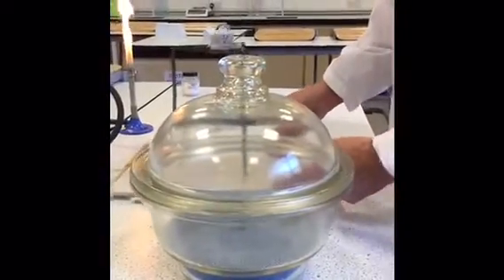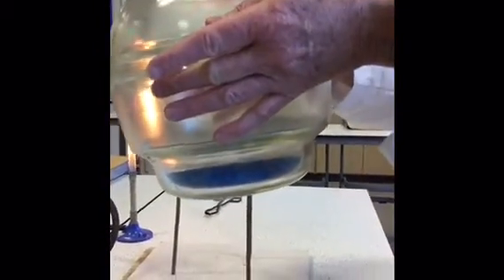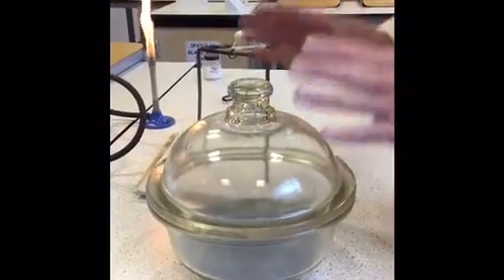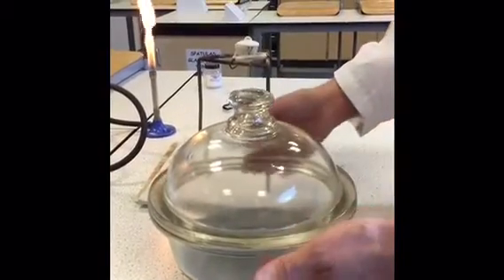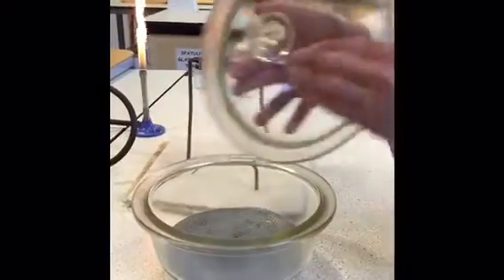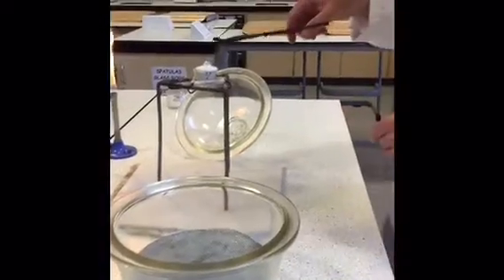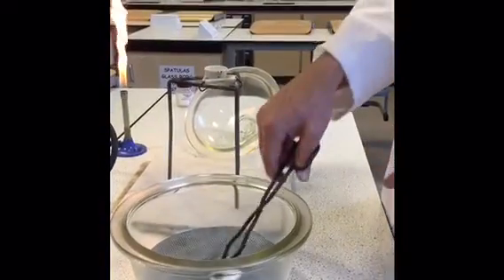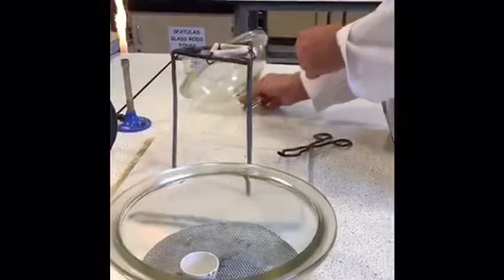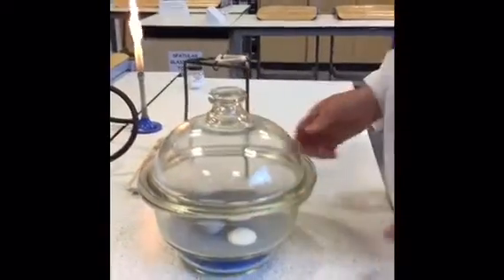Okay. So just a few points about the desiccator. At the bottom of the desiccator, we've got a drying agent which absorbs all the water from the air in the desiccator. Whenever you pick the desiccator up, make sure you hold it by the bottom and the lid, because the lid just slides off. So I want to transfer my crucible into the desiccator now to allow it to cool down without reabsorbing water from the atmosphere. So I'll put it in there and leave it for about 5 minutes.